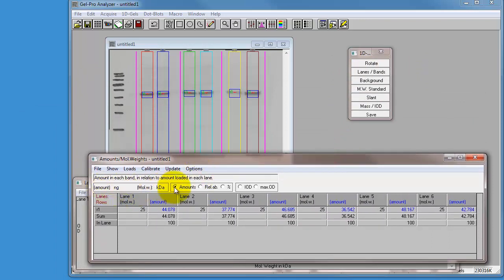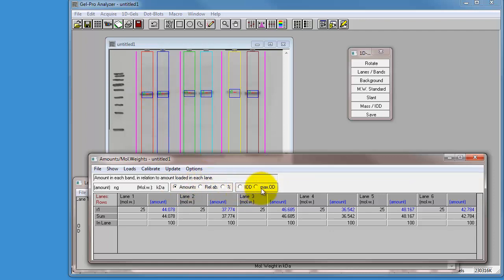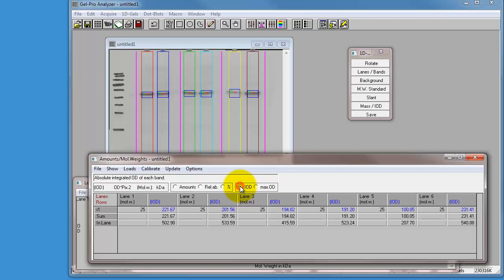But the great news is you've got a choice at the top. You've got amounts, relative absorbance, or percentage. Well, we want to do amounts because we want to work out what the expression is of each of these proteins. And then in the second little box here, you've got IOD or max OD. Obviously, if you're looking for peaks, you'd choose max, but we're interested in the total size of the band, so we choose IOD.